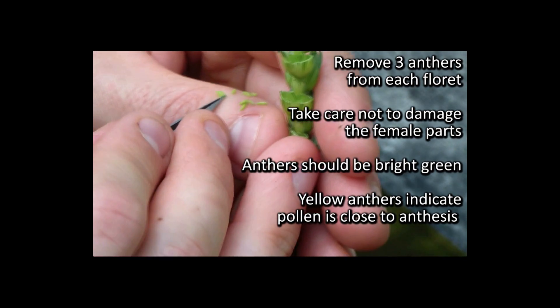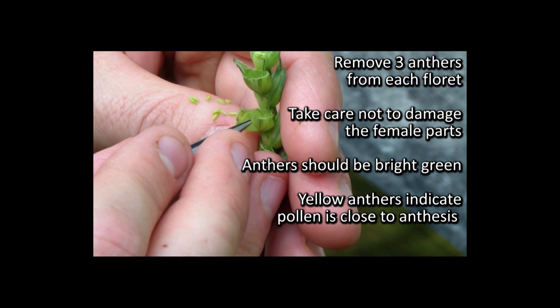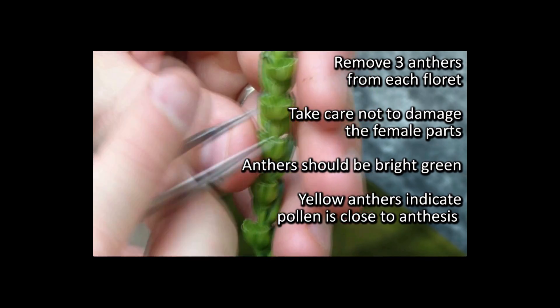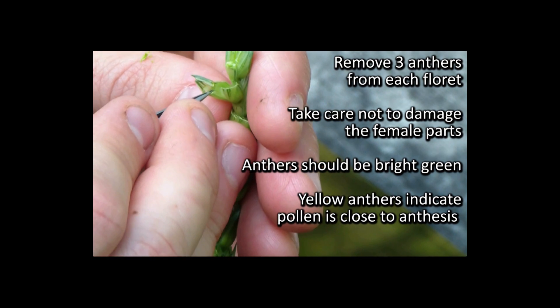The anthers are very bright green. If at this stage they are starting to look yellow, this means that the pollen is probably getting too close to anthesis.